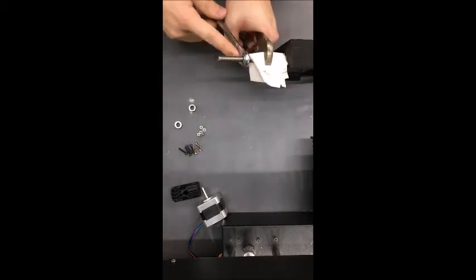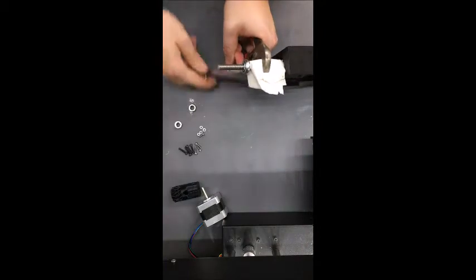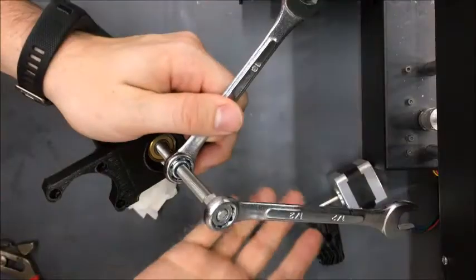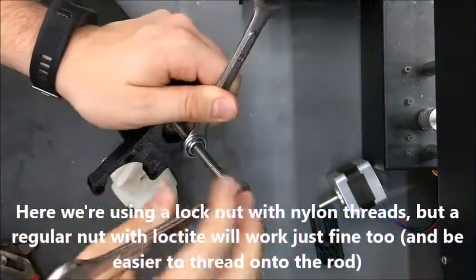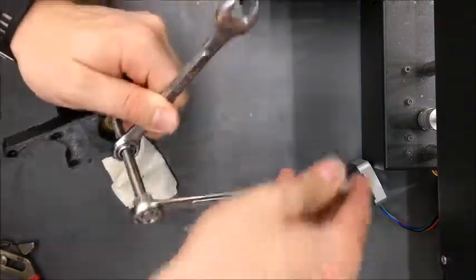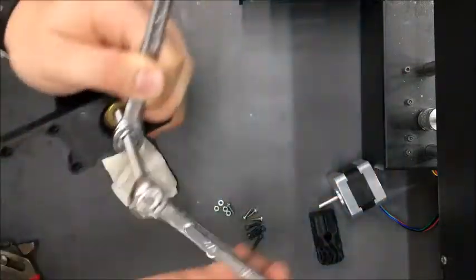You don't have to use a lock nut — you can use a regular nut with some Loctite, which is probably easier. I prefer lock nuts because they don't leave the residue Loctite leaves if you have to take it apart. An easier technique is to use two nuts counter-tightened and locked against one another as a handle, then use another wrench to tighten the lock nut down.